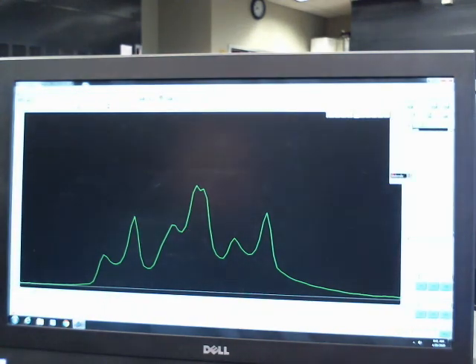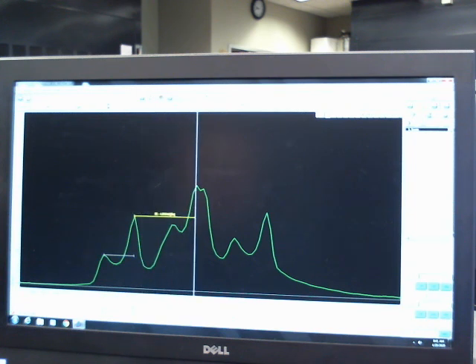So I'm going to come down here to the measure tool. I'm doing a horizontal measurement. I'm going to measure from here to here, and it's 2.47 hertz. And then I'm going to measure from here to here, and it's basically 4.99, or 5 hertz. Okay, so those are my two J's. You can look at this again to make sure you get that data down. This is for proton B. Those are the two J's.